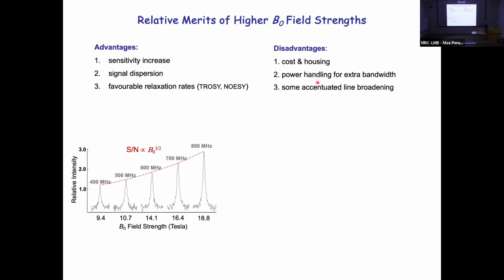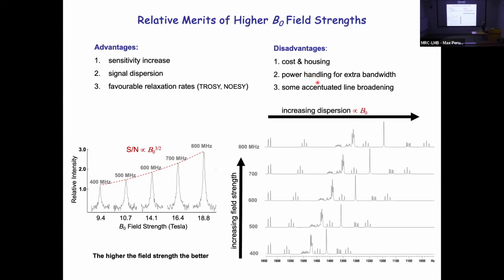And yeah, we don't need to worry about the rest of it. What we see then is this idea of increasing dispersion. Because of the local magnetic fields that we have within the molecule, the different nuclei, in this case hydrogen nuclei, each different hydrogen nucleus produces a separate signal at a distinct position because it has different effects of local magnetic fields on it inside the molecule.